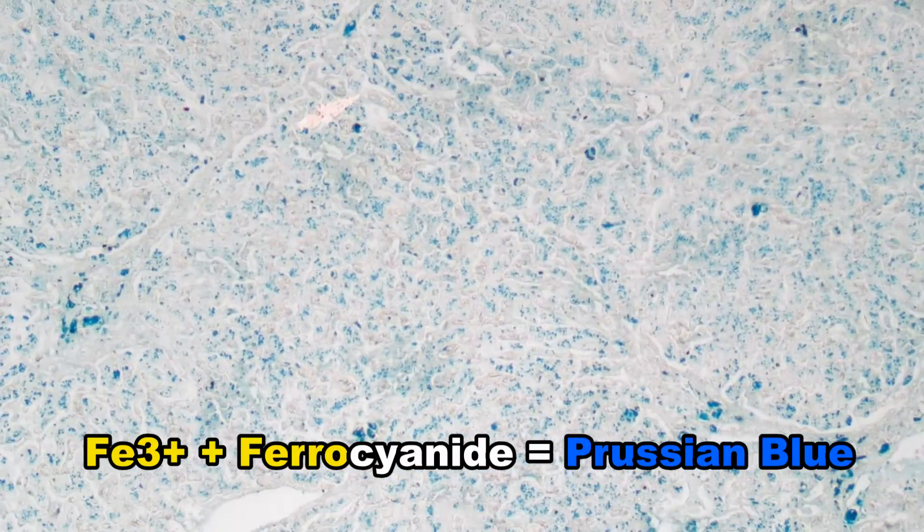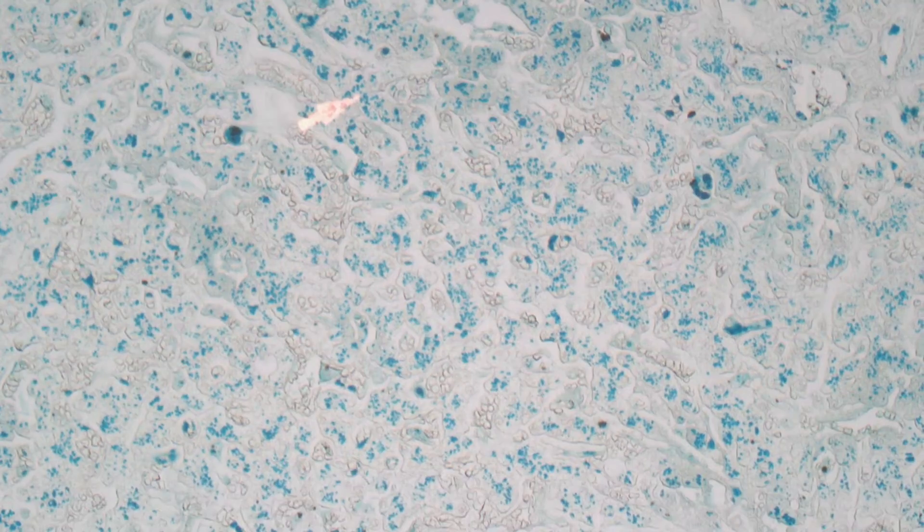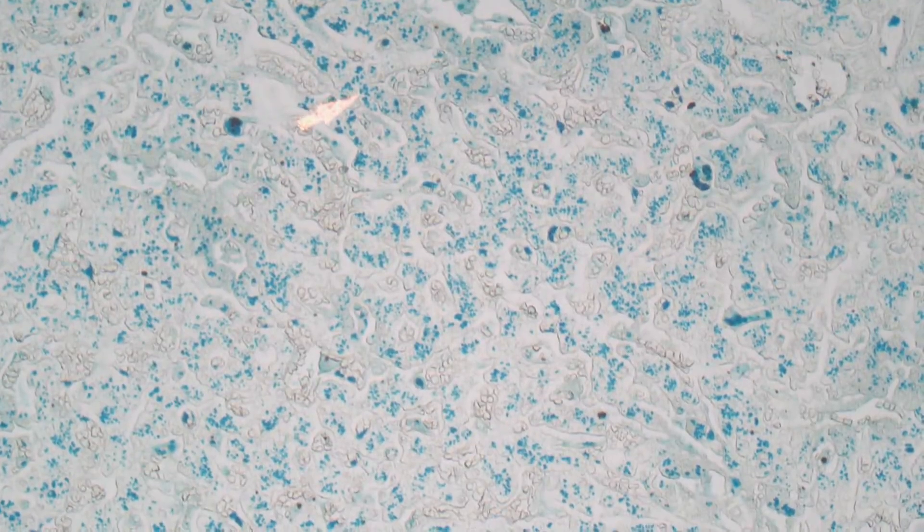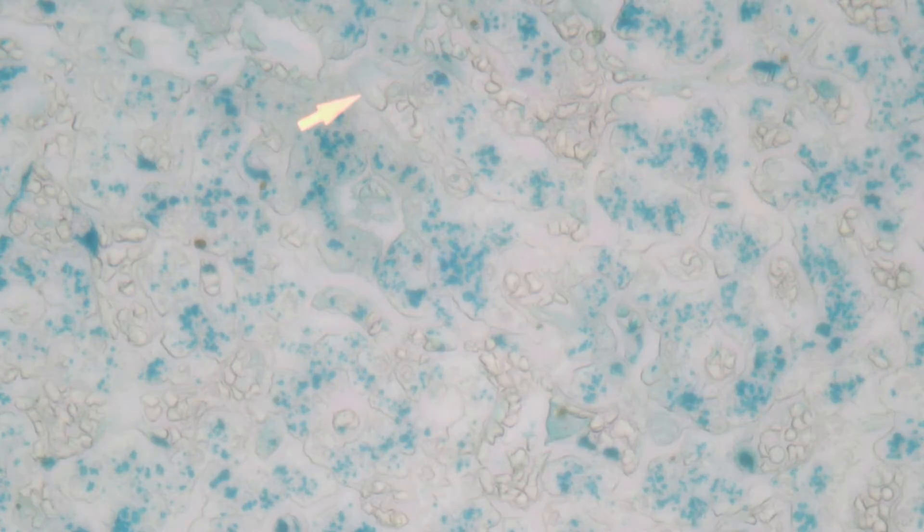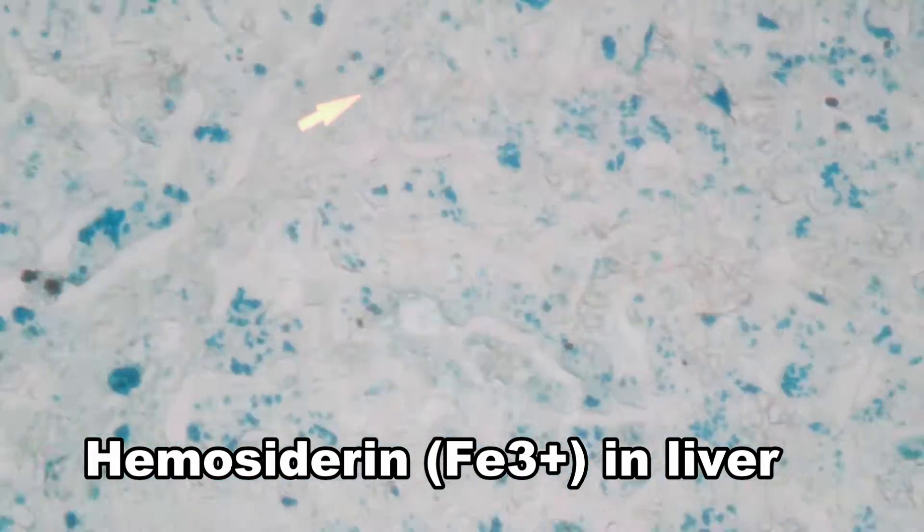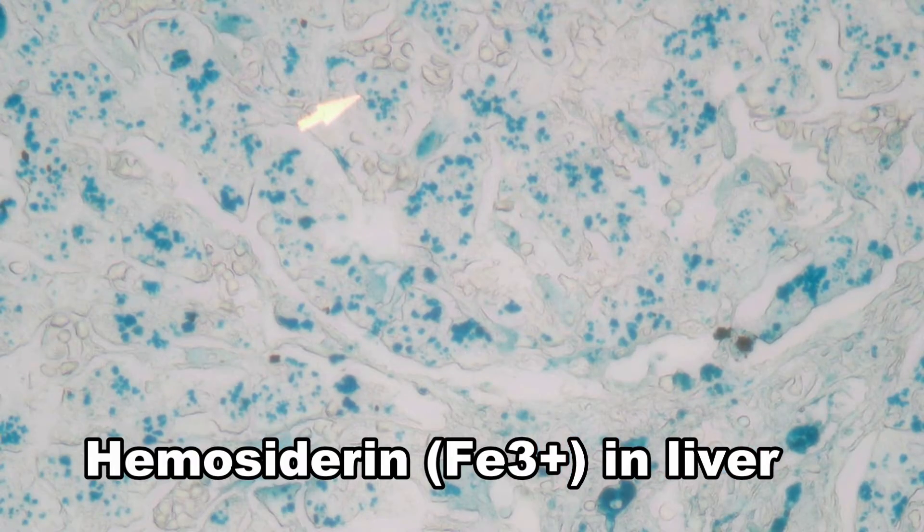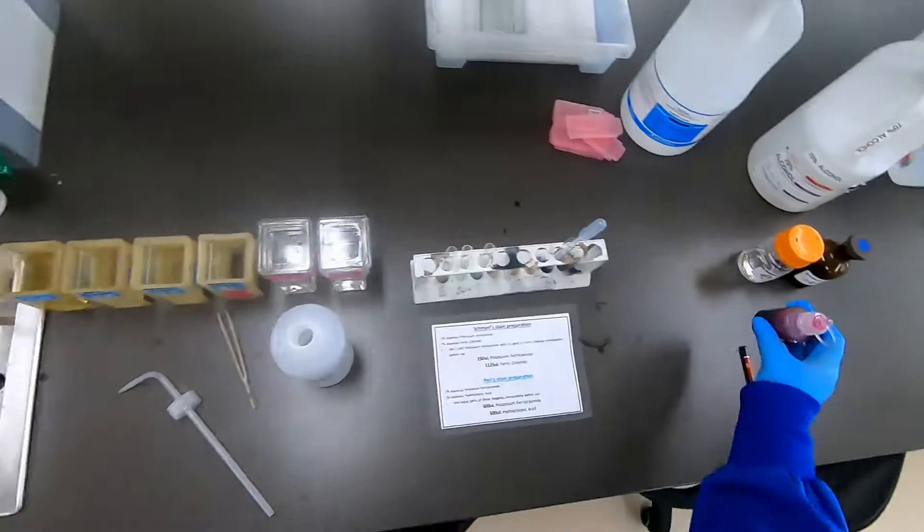What we can see here is that the Fe3+ ions have been released from hemosiderin in this liver by the hydrochloric acid, and then before they can migrate away, they are precipitated in place with the potassium ferrocyanide to form this Pearl's prussian blue. We can see a nice demonstration of those granular deposits.